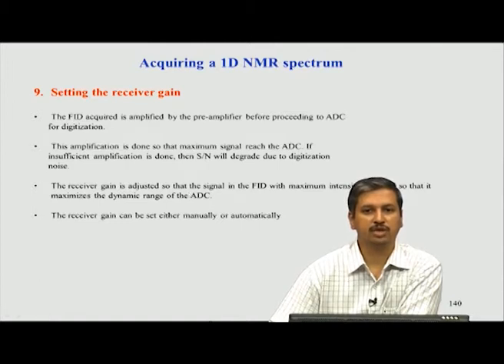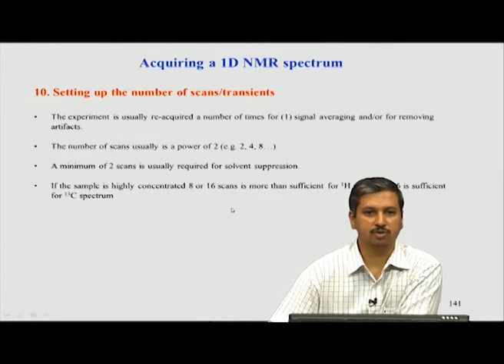You can think of ADC overflow in a similar manner, like let us say you have a water tank, filled with some amount of water. If you fill more than that, it will start overflowing. So, similarly ADC has a limited capacity to hold the signal strength, and if you have more signal strength than what it can take, it will start overflowing. What is overflowing? It will simply omit the signal. Okay. So, this is the second important step.